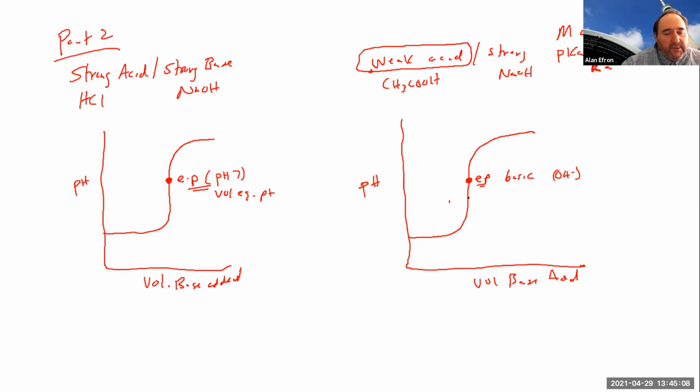So if you have this really nice curve, as we talked about before, even if you maybe can't figure out exactly where the equivalence point is, maybe here, you're not sure if it's there or there, the nice thing is that it is pretty vertical, which means even if you're off a little bit, the volume that you would get for being near the equivalence point volume is pretty much going to be the same. That will allow you to do a stoichiometry calculation, back calculate and figure out what the molarity perhaps of your acid would be.